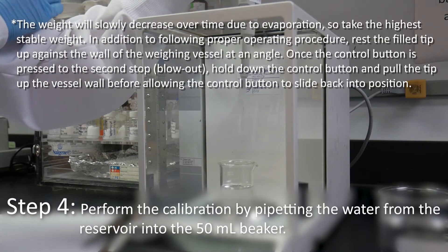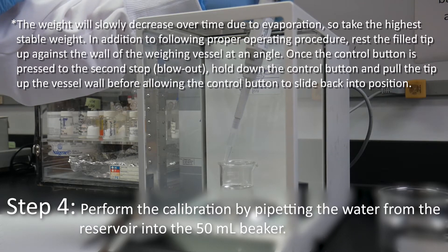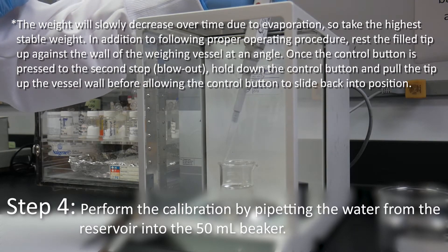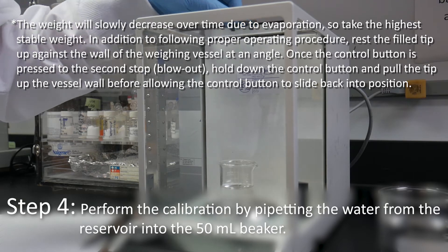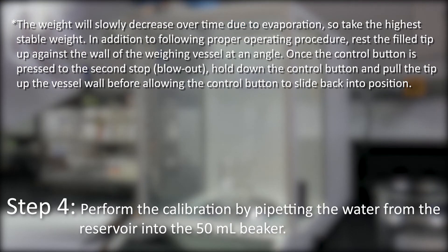The weight will slowly decrease over time due to evaporation, so take the highest stable weight. In addition to following proper operating procedure, rest the filled tip up against the wall of the weighing vessel at an angle. Once the control button is pressed to the second stop, hold down the control button and pull the tip up the vessel wall before allowing the control button to slide back into position.